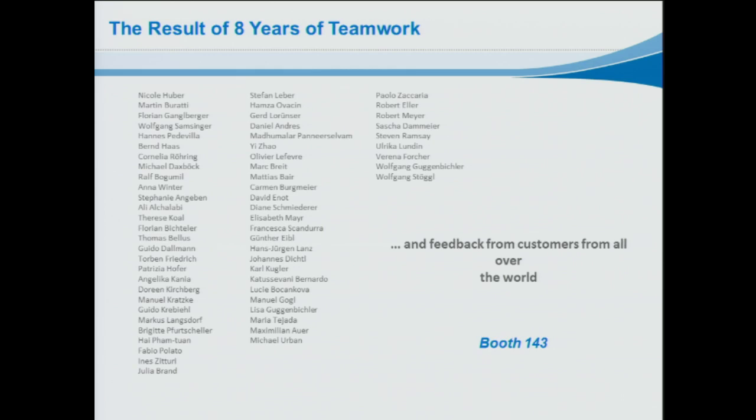Thank you very much, Bernd. One thing that I really like, as mass spectrometrists are starting to be able to collect thousands of data sets in a day, is that you have a very nice organization workflow. We hadn't covered that with the rest of the speakers, and I think this is very key, because as a graduate student or a postdoc sitting in the laboratory, it's really easy to transpose one item of a data set and end up with a completely incorrect interpretation. So it's really wonderful. Are there any questions?